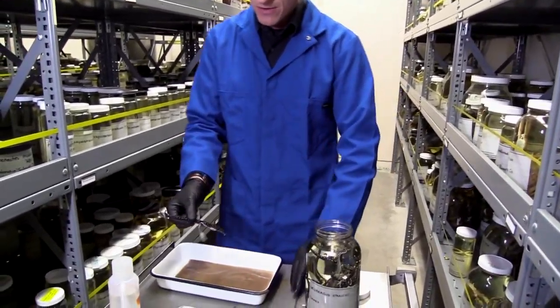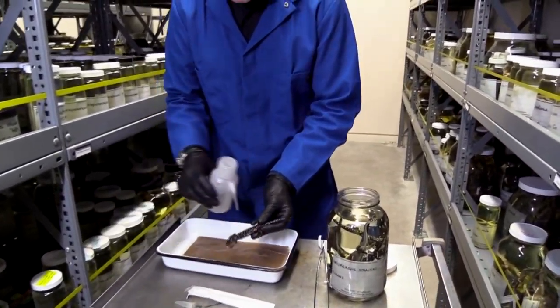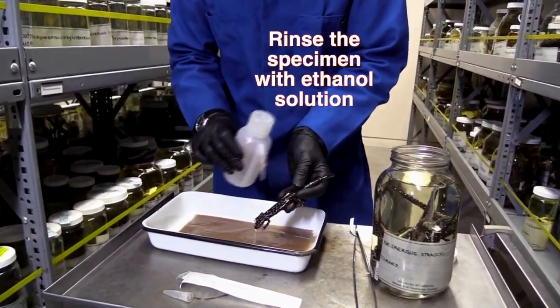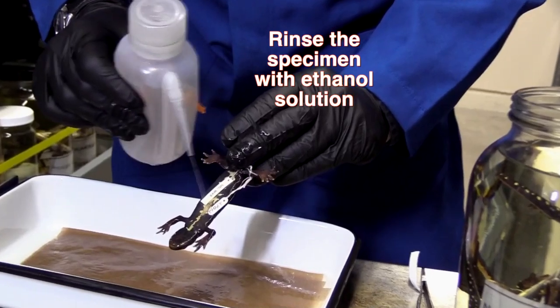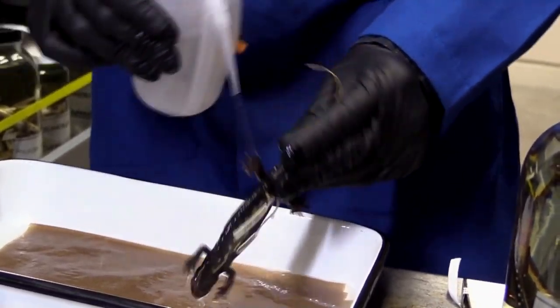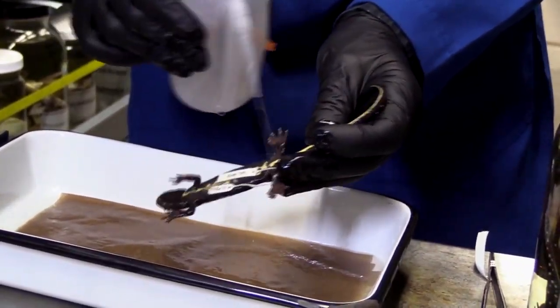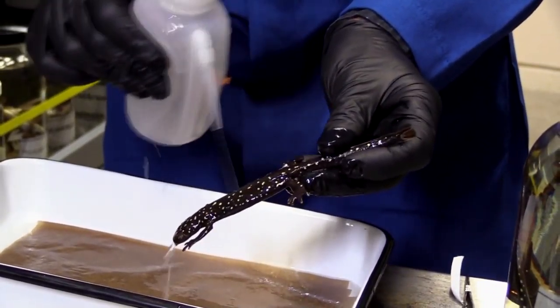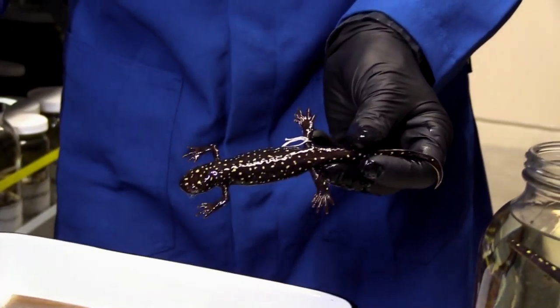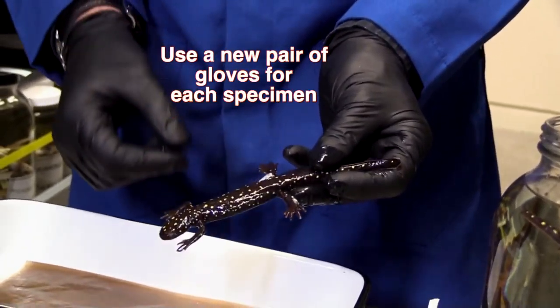We take our animal out, and the very first thing we do is spray it down with ethanol — the same liquid that's in the jar they're housed in. The idea is that if there are any pieces of skin that have floated off another animal, I want them to be washed off. The second thing we do is change gloves between each animal.